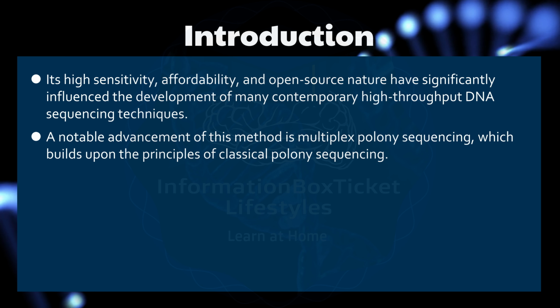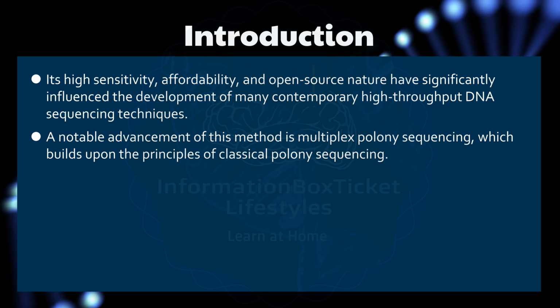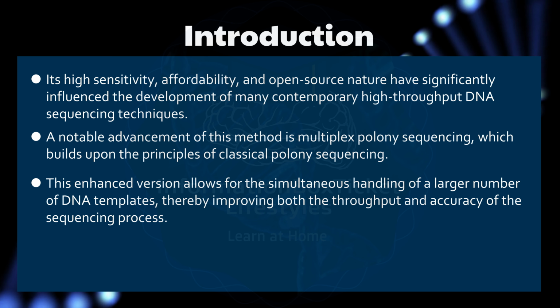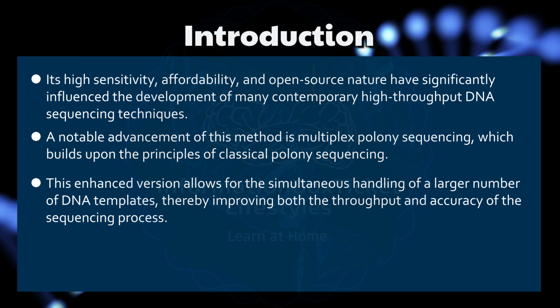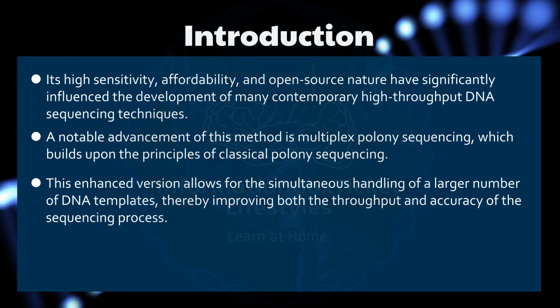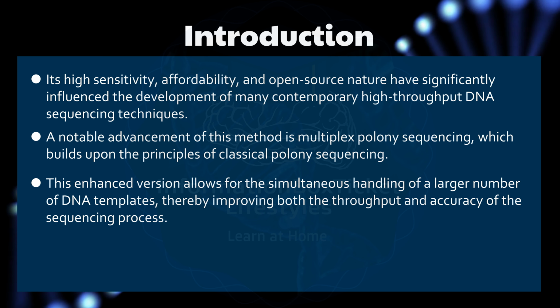A notable advancement of this method is Multiplex Polony Sequencing, which builds upon the principles of classical Polony sequencing. This enhanced version allows for the simultaneous handling of a larger number of DNA templates, thereby improving both the throughput and accuracy of the sequencing process.